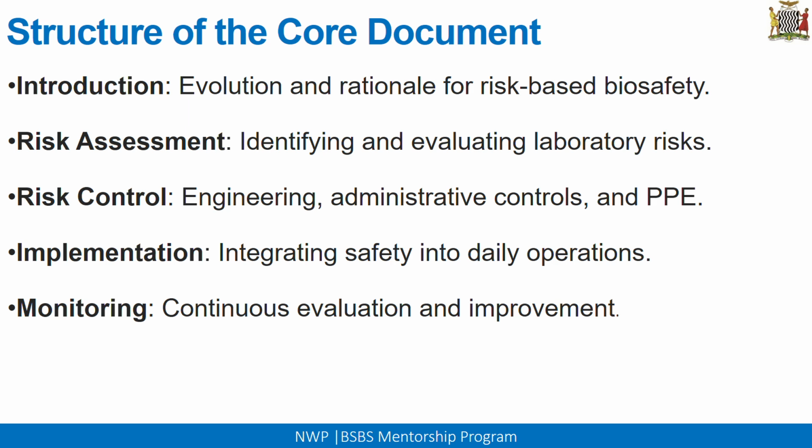So, of course, this is mostly a repetition from the previous. So there's been an evolution and rationale for risk-based biosafety in this particular document. Then risk assessment, identifying and evaluating laboratory risks. So this is like the structure that the document follows.